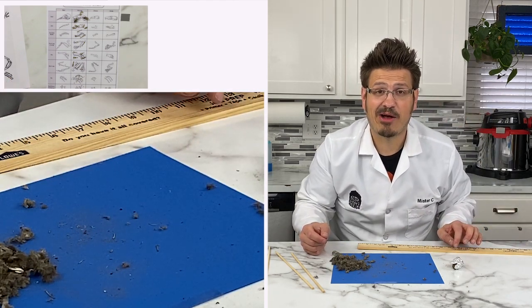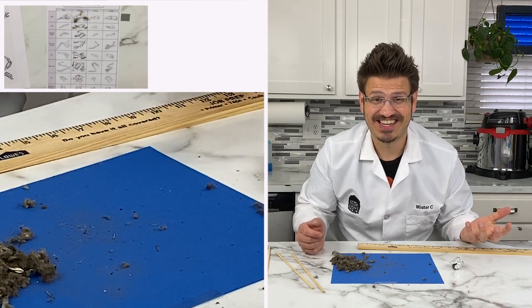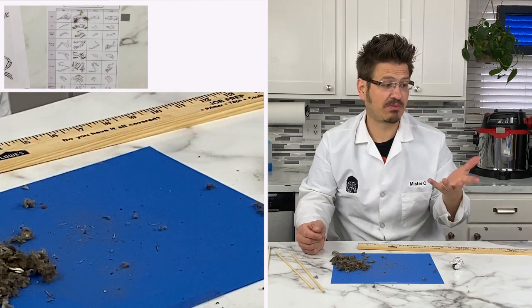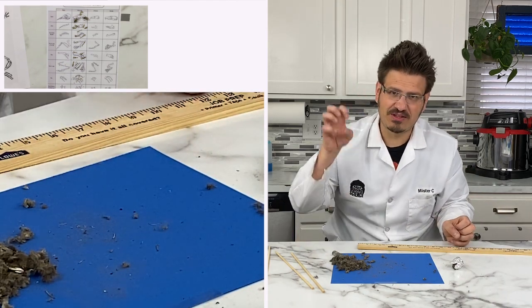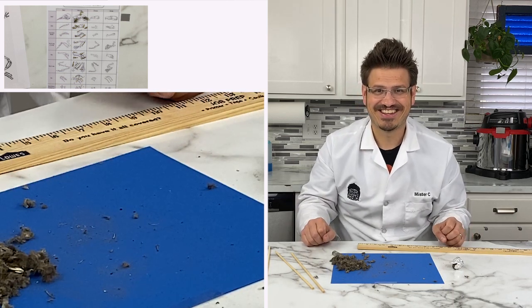We get to dig through an owl pellet that was regurgitated by a barn owl to see what kind of critters it was eating. And, oh, something really cool, like if an owl gets a creature that it can't swallow whole, it uses its beak to tear it into pieces and then eats it. How awesome is that? So cool.